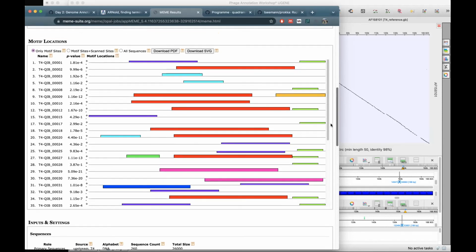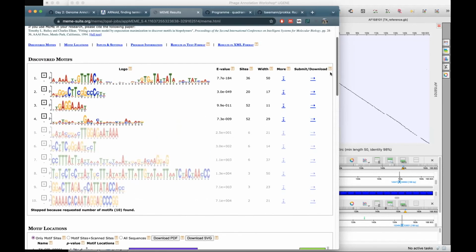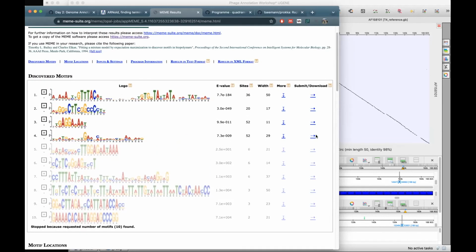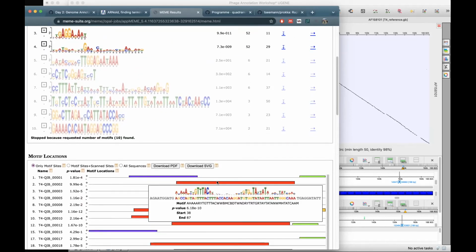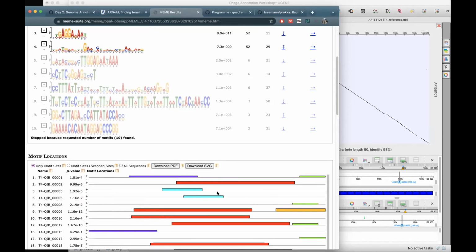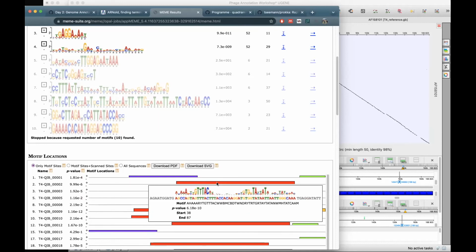Hani asked how to apply the two mismatch rule. In that case, you would have to look at the locations of these 36 sites and verify what the actual sequence is in that location. So in this case, when we click on it, see if it, oh no, it doesn't stay. We can see that this one specifically has GTTTAC, so that -35 box is identical. And oh no, this is just a motif, sorry.